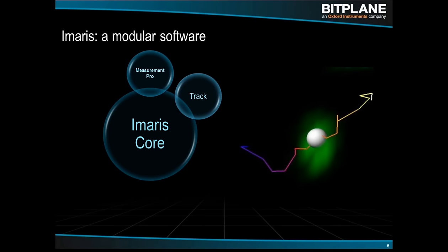So you have a collection of objects at time frame 1, and you have a collection of objects at time frame 2, and the job of a tracking algorithm is to determine which ones are the same object, which ones are new objects that just appeared, in which cases did objects disappear and potentially split or fuse and so on. All of those things are related to a tracking algorithm.